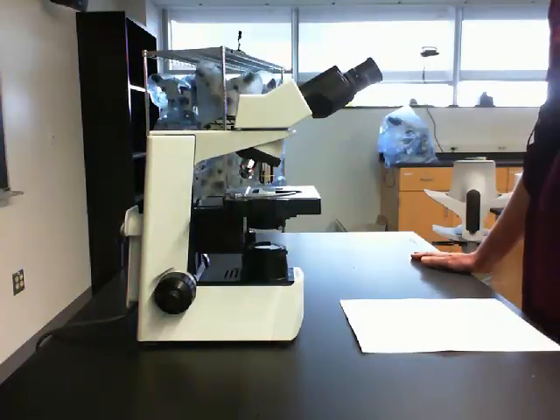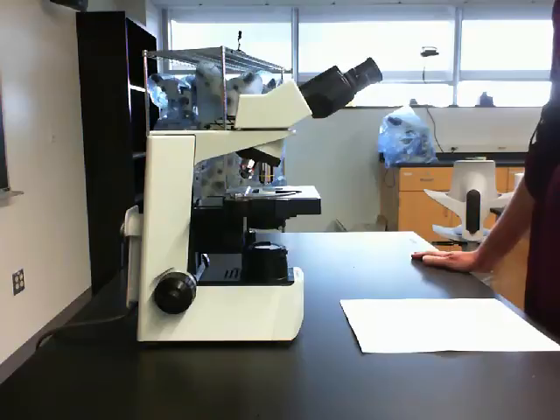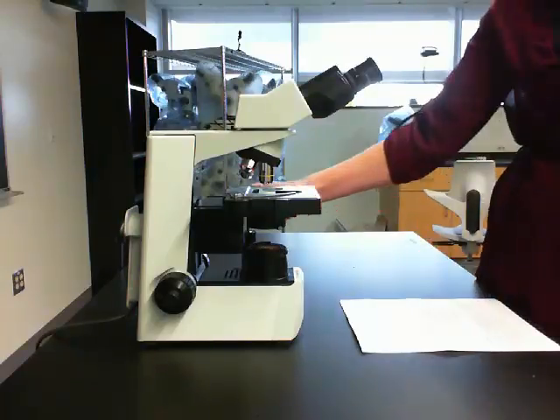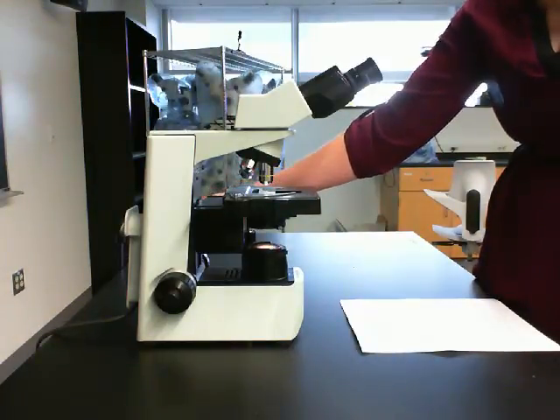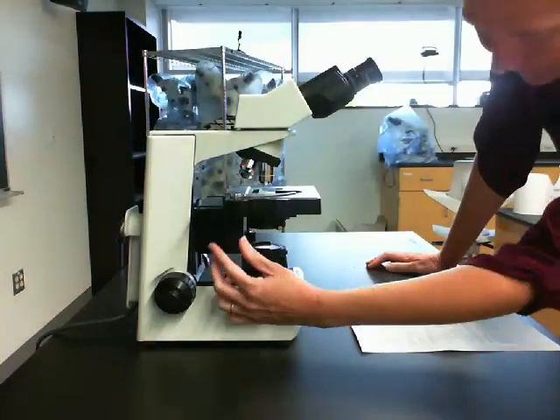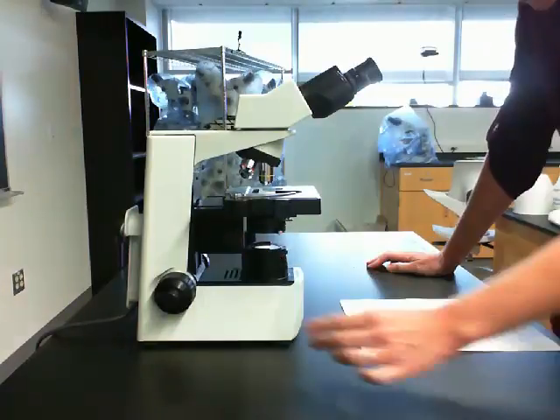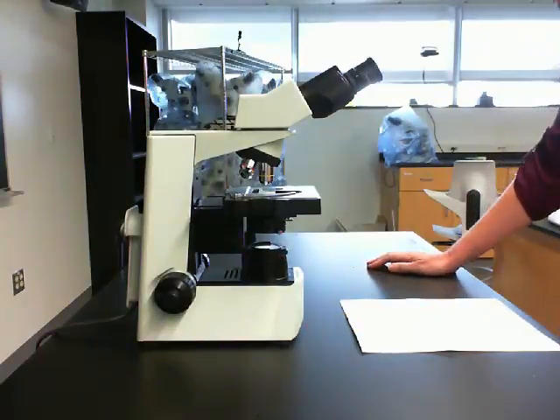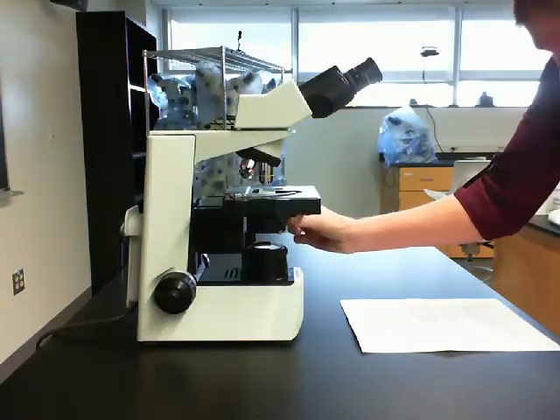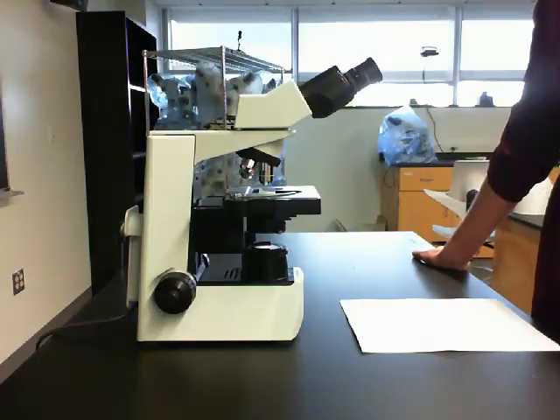Again, to make the best observations using a microscope, you need to continue to adjust the lighting of the scope. During your practice, be sure to adjust the light intensity, the condenser lens, and the iris diaphragm. The light intensity changes the brightness of the light. The condenser lens collects and directs the light. And the iris diaphragm works like the iris of your eyes. What happens to your image as you adjust each of these settings?